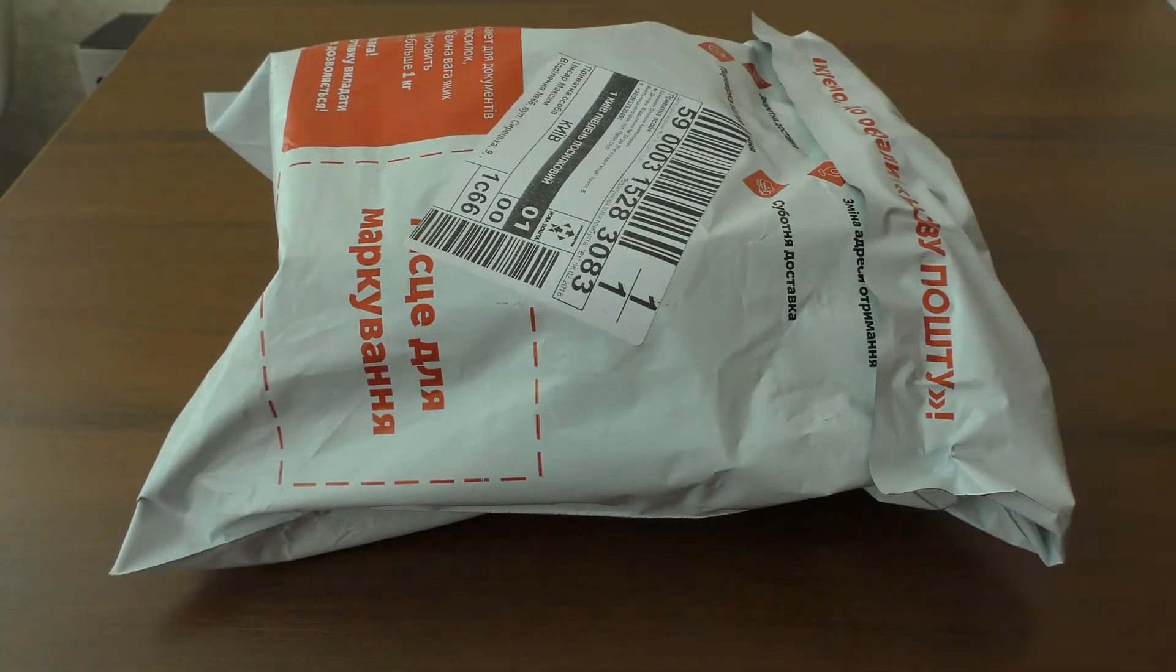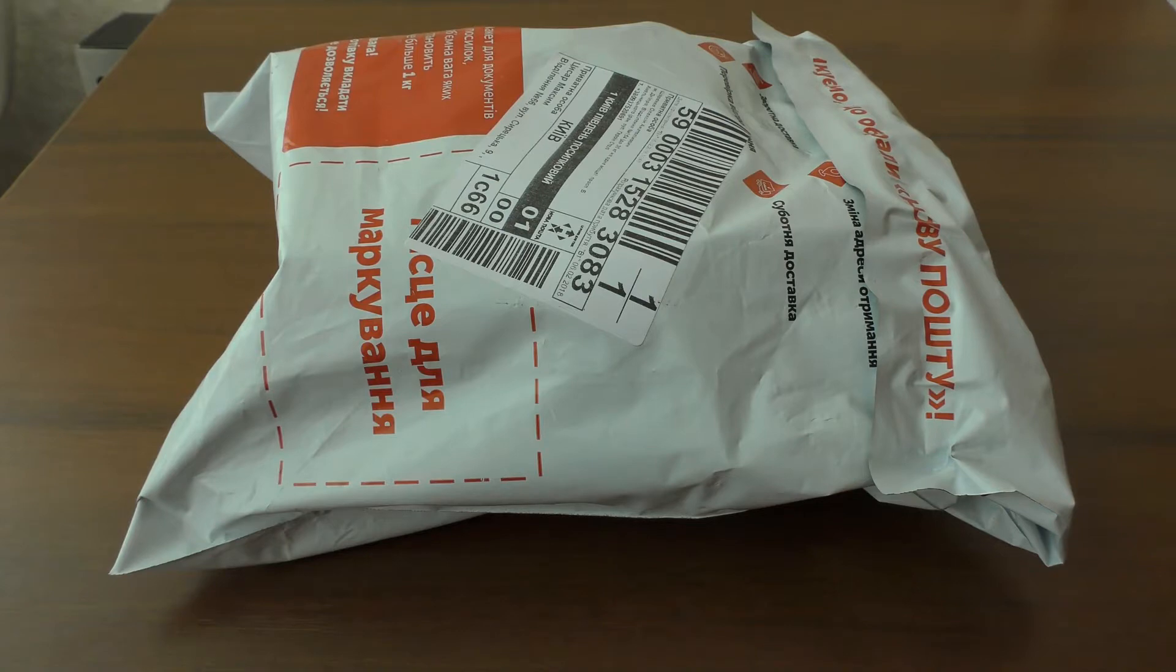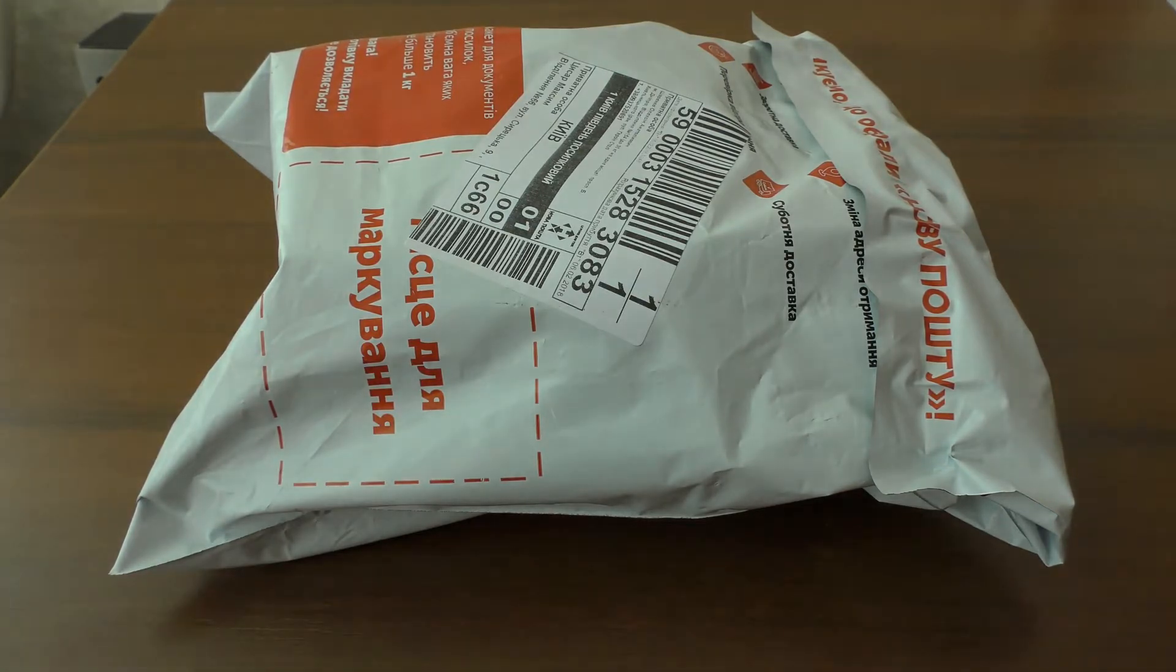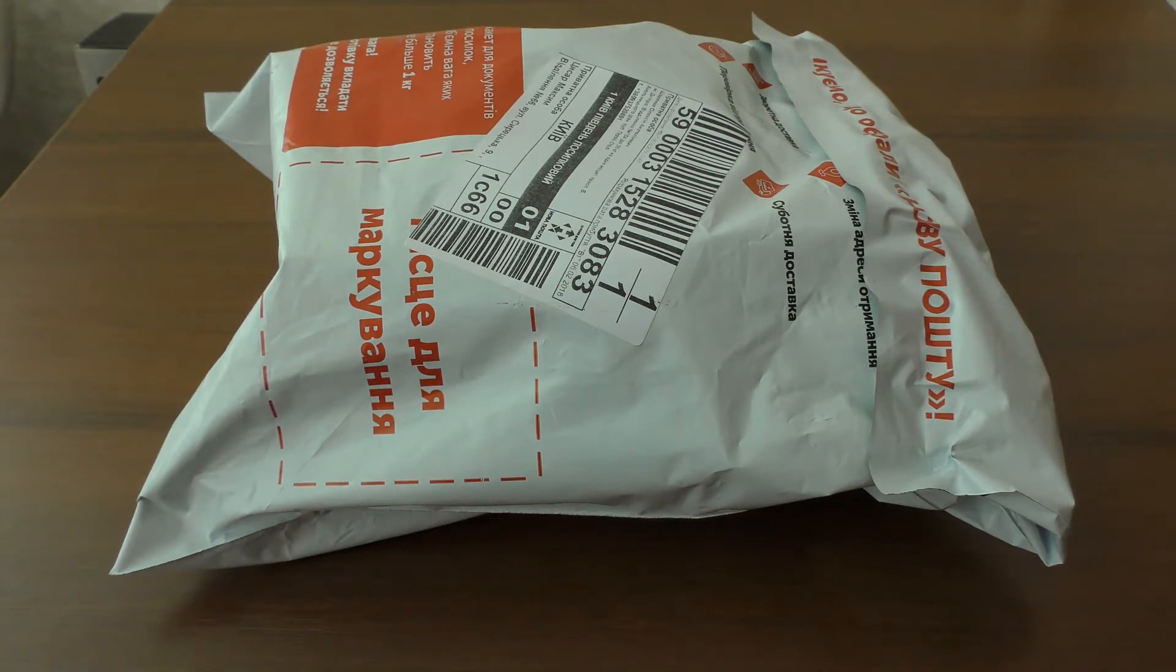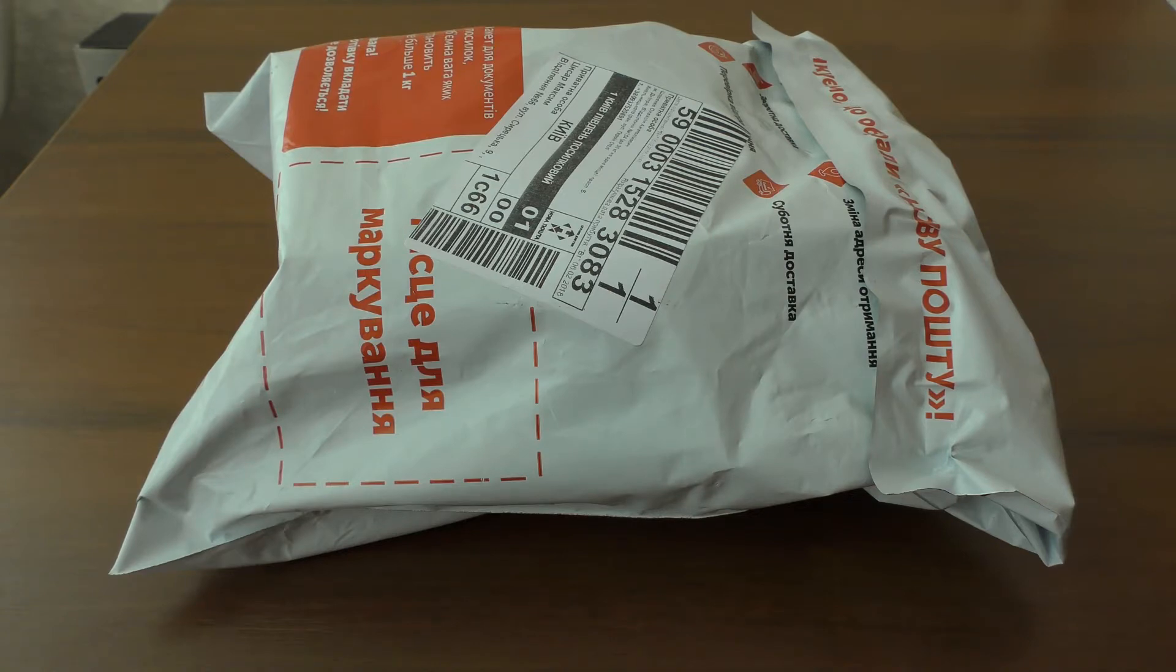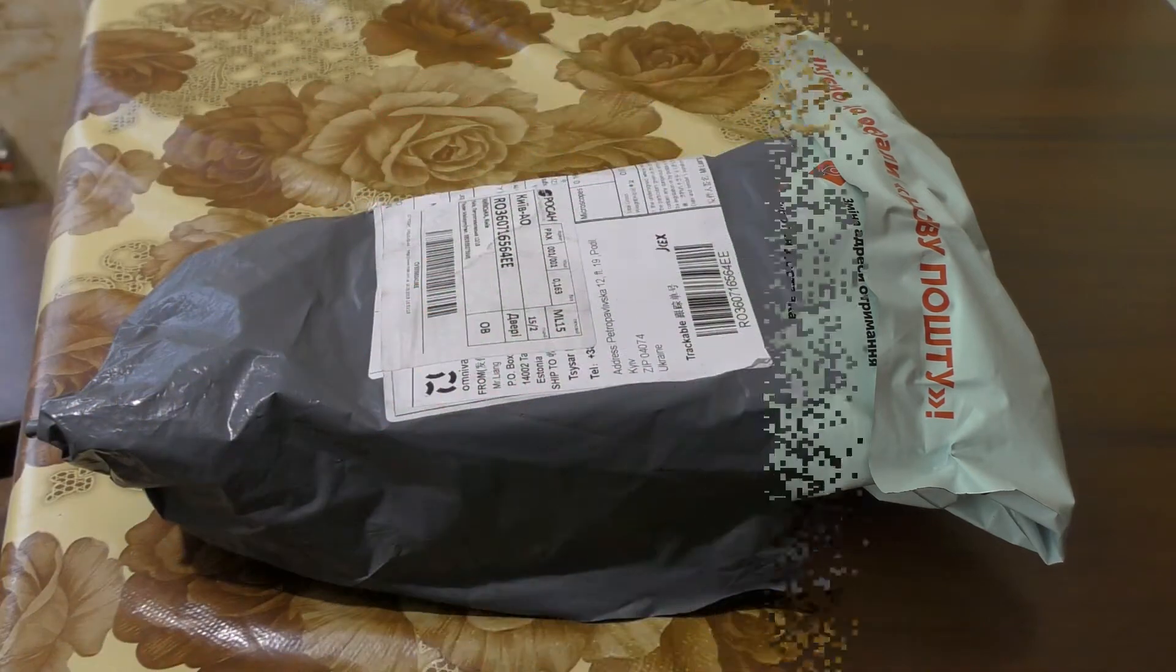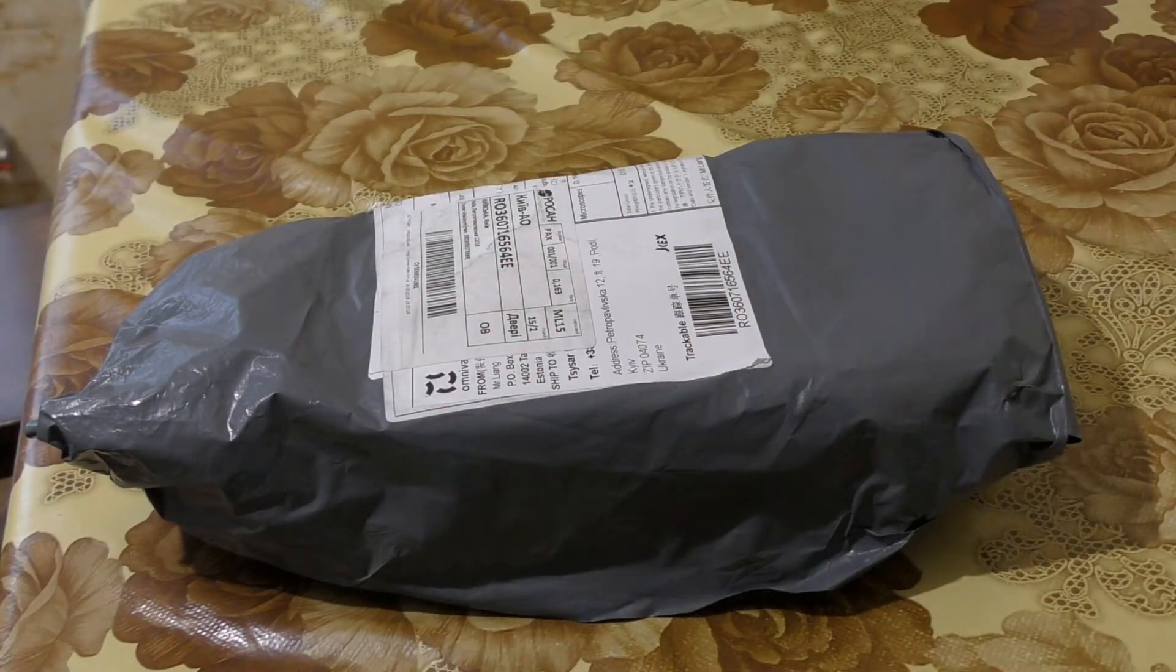Good day, good evening, and good night. Here on our table today you can see a package with a 5 megapixel USB flash camera for the microscope. Now we will unpack it and see what we got inside.